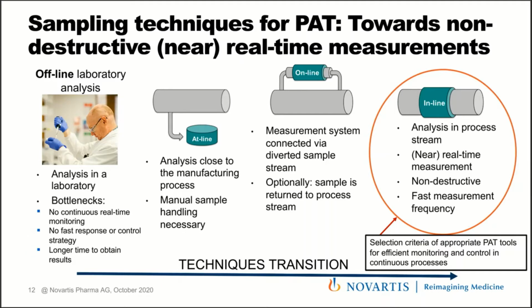So I briefly explained the selection criteria which we are looking at. We are not looking at techniques such as online HPLC systems, because they are not inline. So today I will briefly show you the inline techniques.